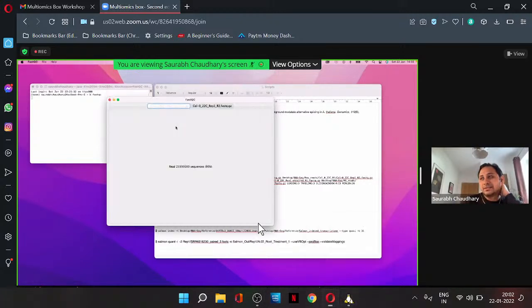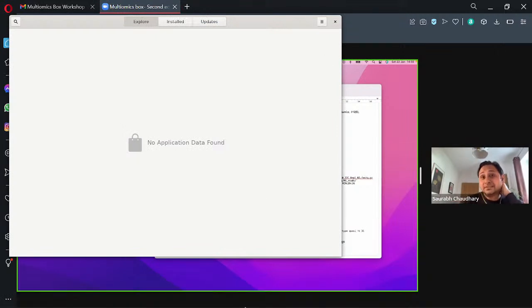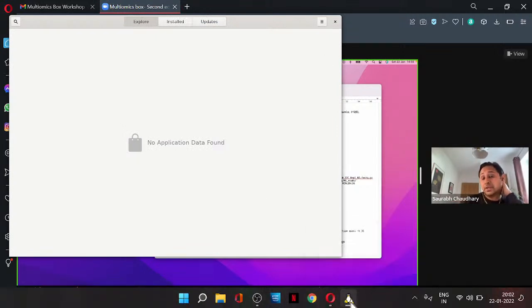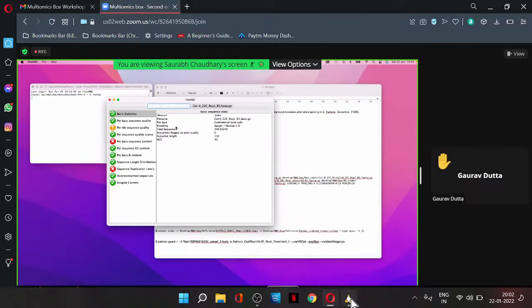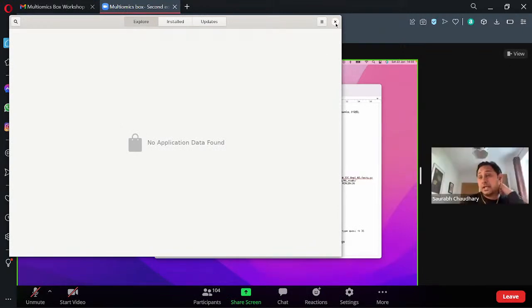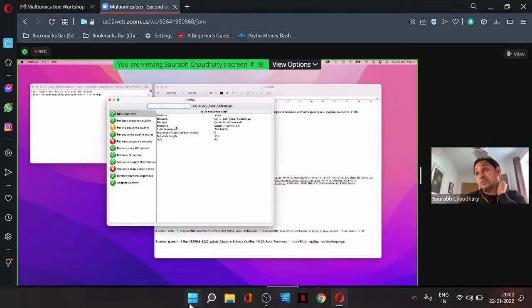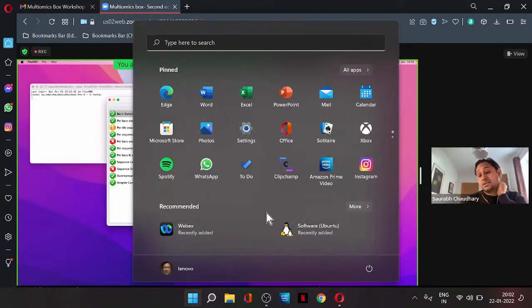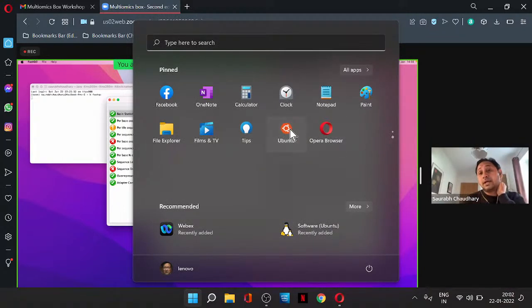So I think bigger than that. For example, wheat. You can use STAR if you are working on wheat. You can use it for animals too. Of course, animals have comparatively big data as well, especially humans and rats. So yes, the STAR aligner is good if you're working on those.